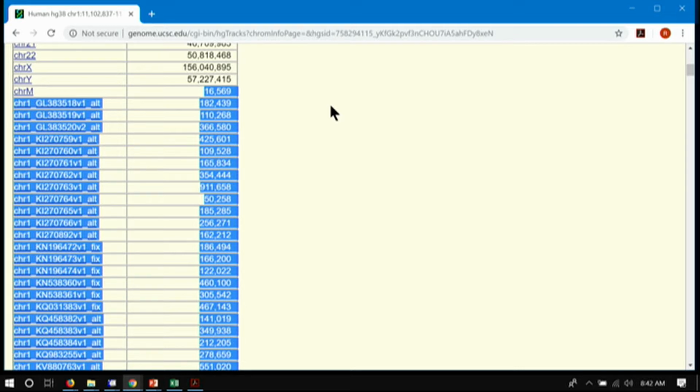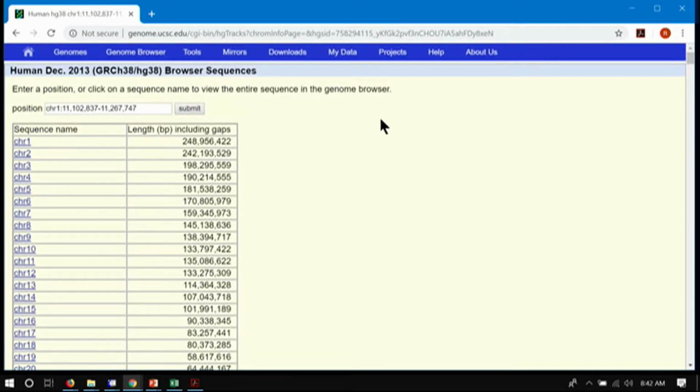So some of your reads may map to these alts. And so your bioinformaticians need to know about those if they're going to use HG38, because if something maps 4 places, it might map to 3 alts. So it's really uniquely mapping, not 4 places in the genome, but 4 copies of the same place in the genome that have been rearranged. And those are different things. And so your bioinformaticians need to know about that. And that's part of the reason why HG38 is not as widely used yet, because not everyone has written pipelines that are sensitive to that.